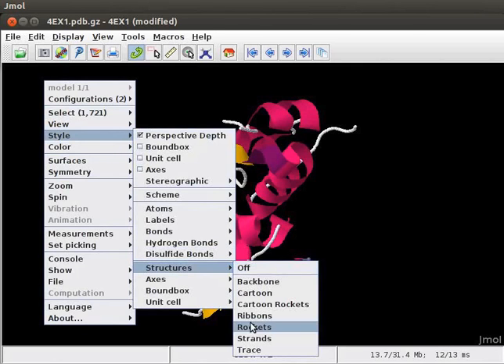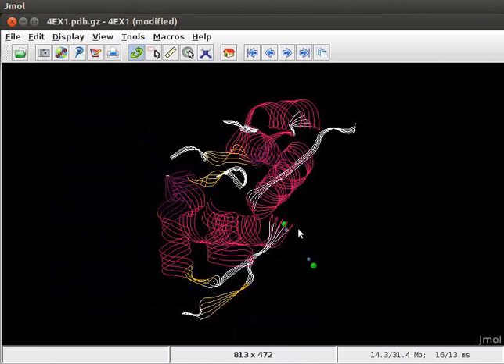For example, click on Strands option. The protein is now displayed as strands on the panel.